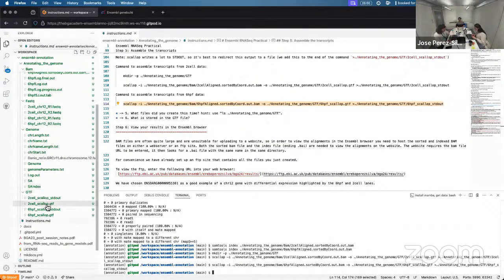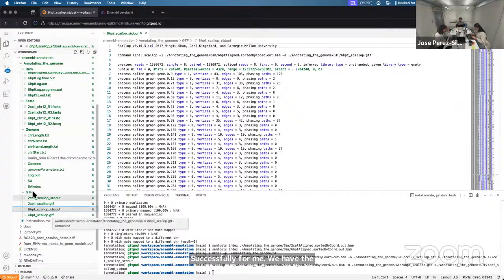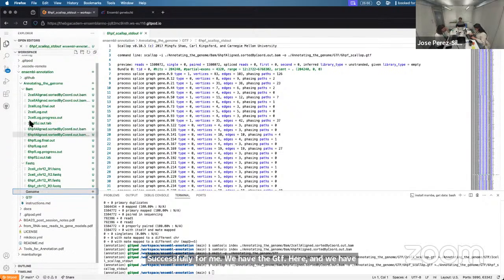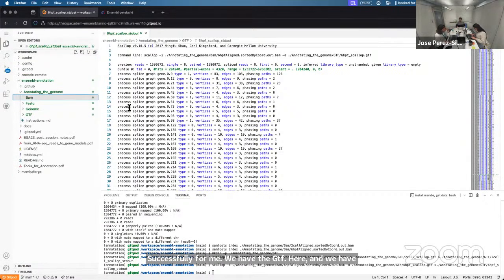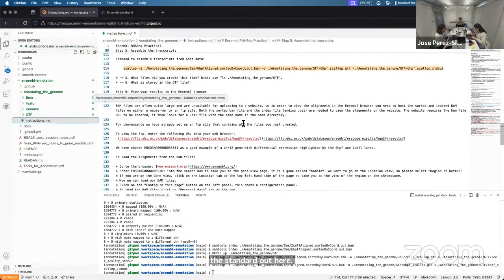Sure, it has finished successfully for me. We have the GTF here, and we have the standard out here. Let's clean up the view a bit. And yeah, now if you all confirm that you have finished with that, we will start with a more fun part.